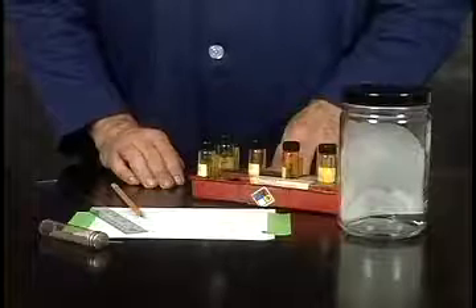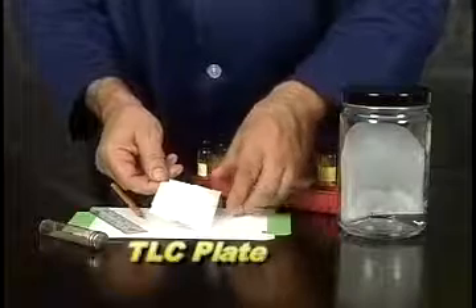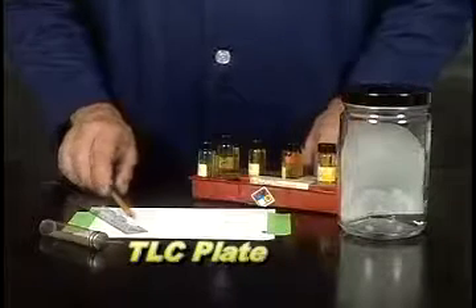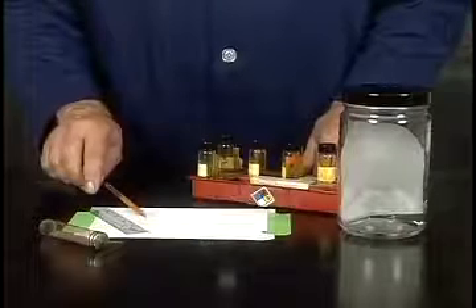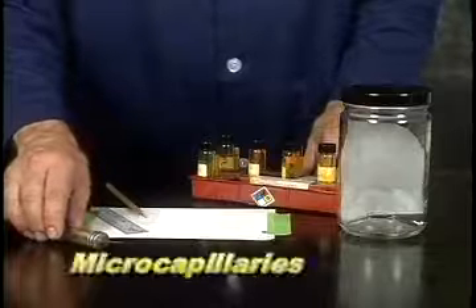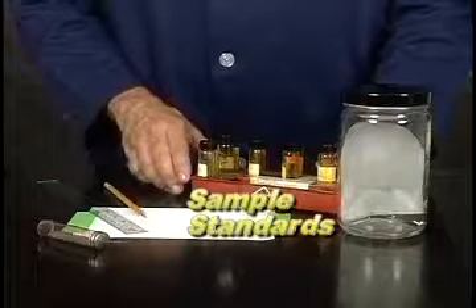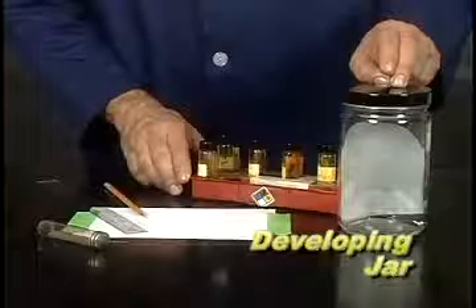What we'll need for TLC analysis is, first of all, a thin layer chromatography plate. This is matte on one side and shiny on the other. We're going to be spotting the side which is not reflective — that's the side coated with silica. You'll also need a sharp number two pencil, a ruler with a millimeter scale, micro capillaries (similar to melting point capillaries but thinner and open at both ends), standards of the samples to be analyzed, and a developing jar for each solvent to be used.